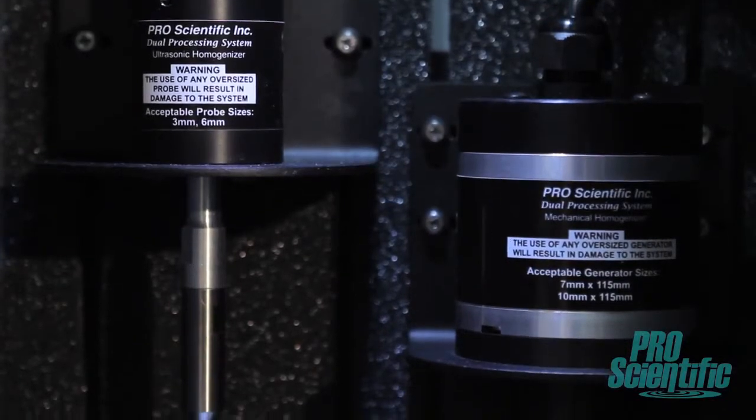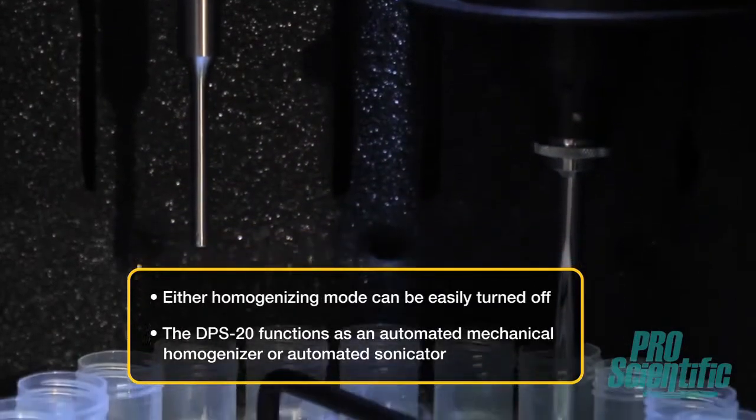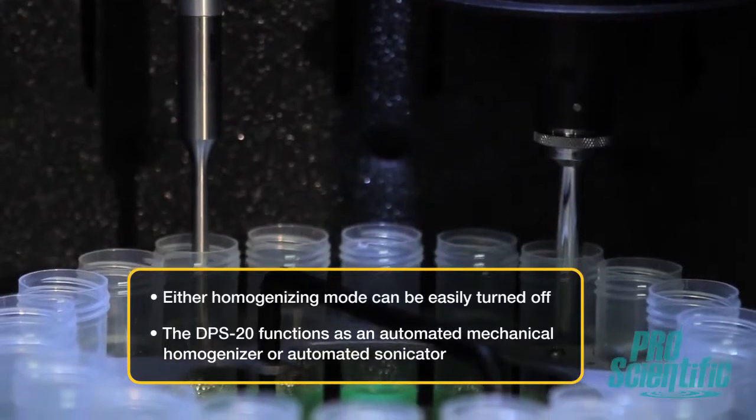However, if your specific sample would not benefit from dual processing, either homogenizing mode can be easily turned off so that DPS20 functions as an automated mechanical homogenizer or an automated sonicator.